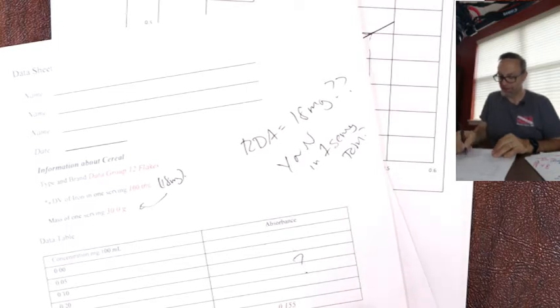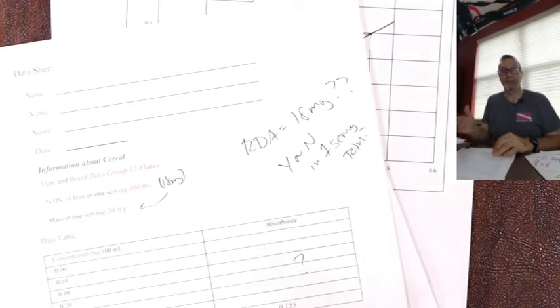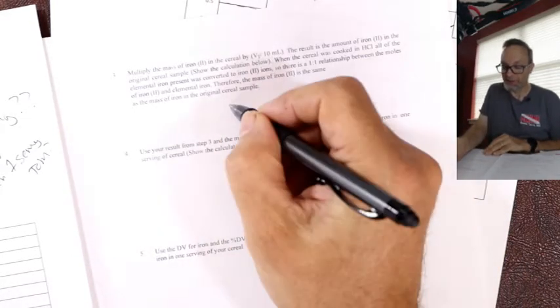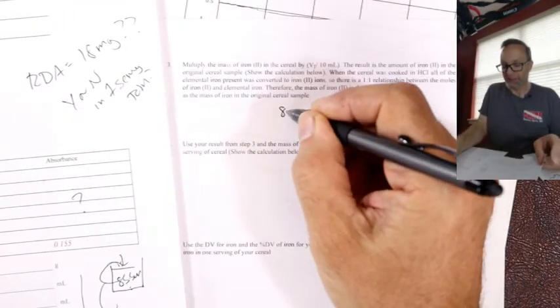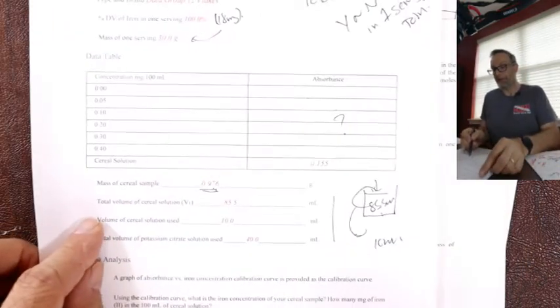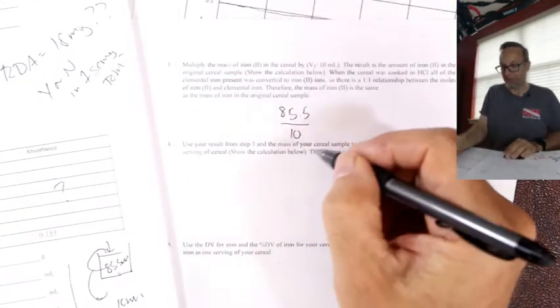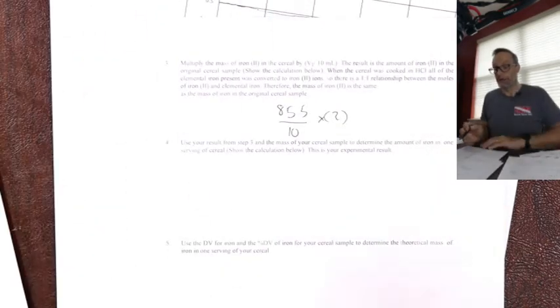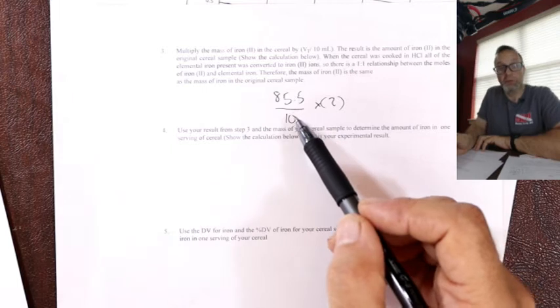But then we just nip out 10 milliliters to test. So obviously there's going to be less iron in the 10 milliliters than the 85 by a factor of 8.5 in this case. So we have to account for that. That's why it says multiply the mass of iron by VT over 10. In my experiment, VT was the volume I got from my experiment. So it's like I'm ratioing up to get the right number. I didn't actually get the number I got from here. I got that much times number 2, if you like. Okay, times number 2. From that point forward, it's actually pretty easy.